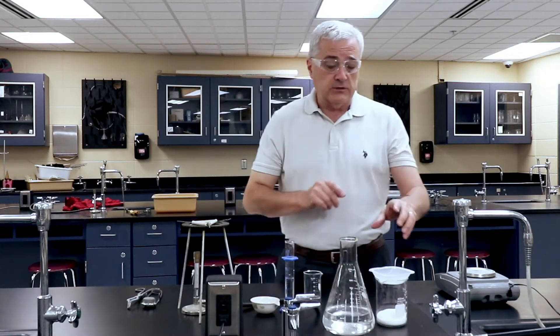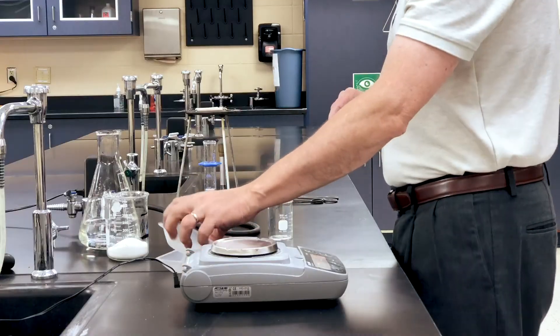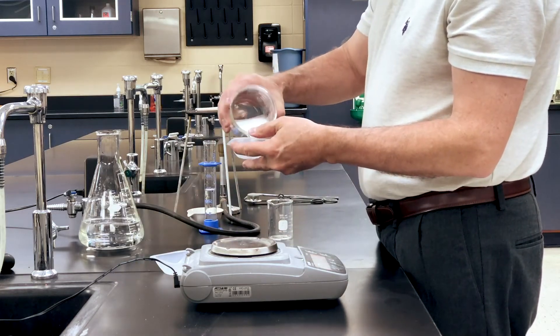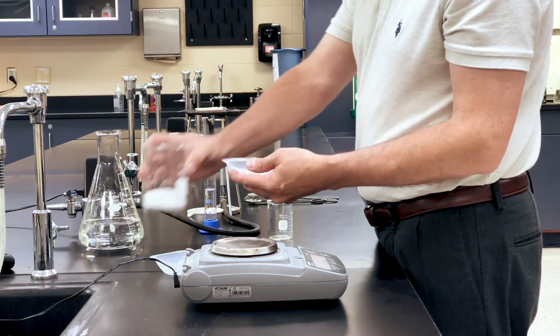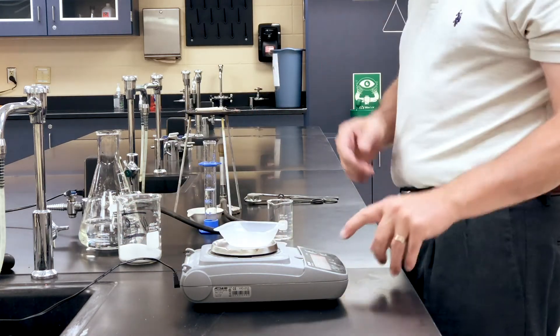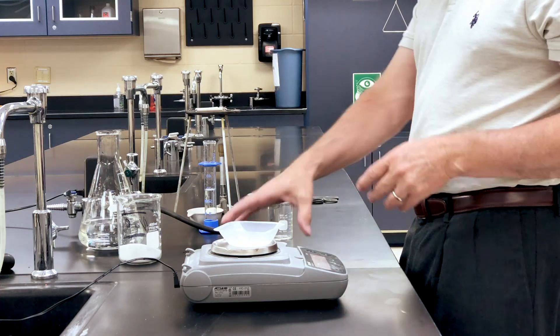We're going to put the 30 milliliters of water into the evaporating dish and then we're going to put the evaporating dish on the Bunsen burner. We're also going to use five grams of sodium chloride. I'm going to use a weigh boat. I'll put the weigh boat on the scale, hit zero, and zero the scale.